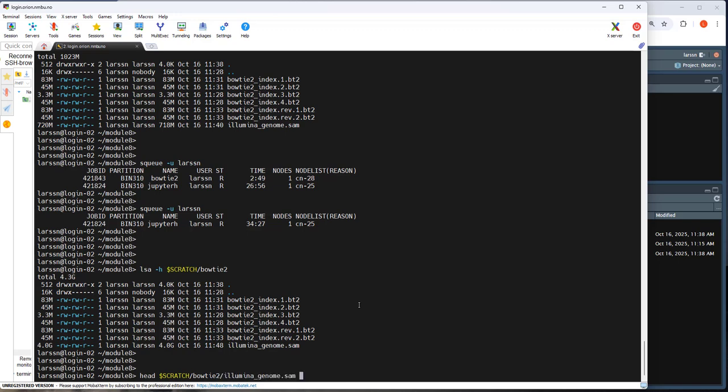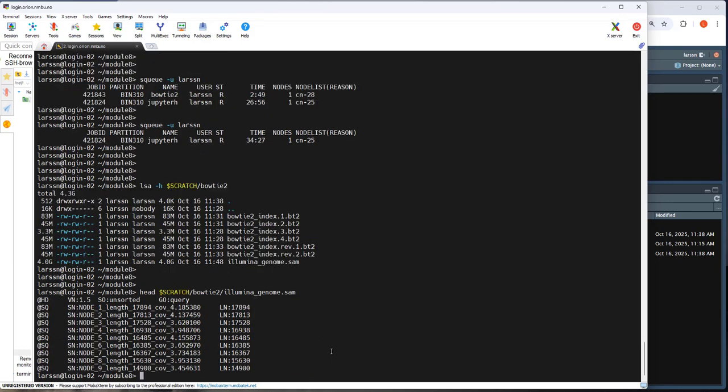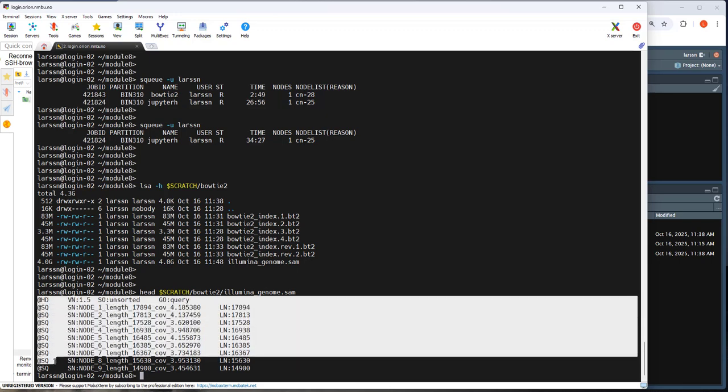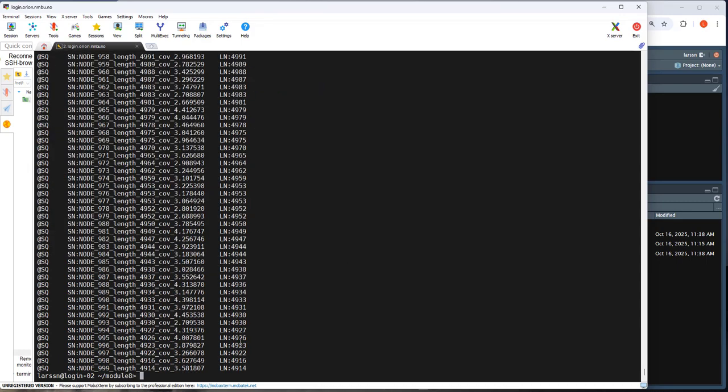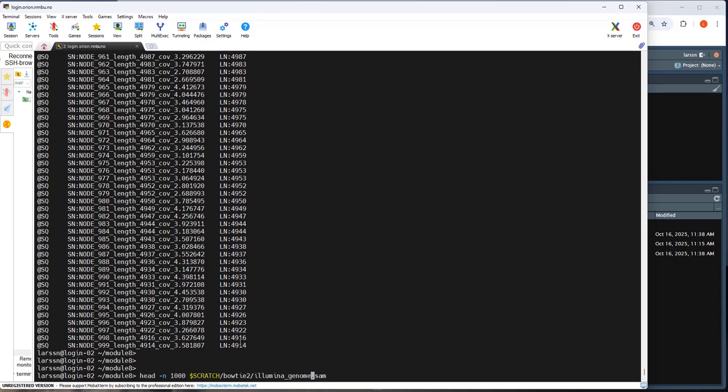And note again, now I use the tab button. Let me see the content, the first lines of this file. And this is how it looks. Yeah, it's not so exciting at the start because it has some header section. Let's see a little bit further down. Okay, so this file has a lot of rows at the start here that I do not want to see.